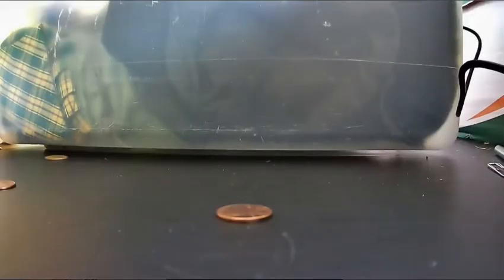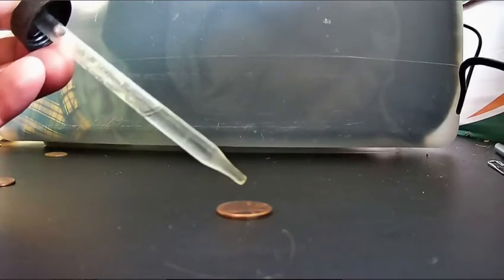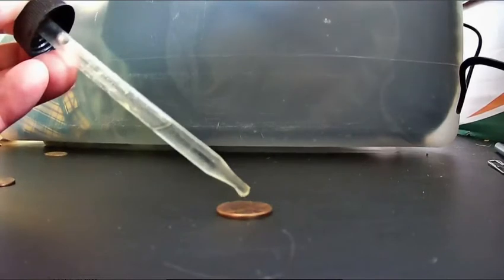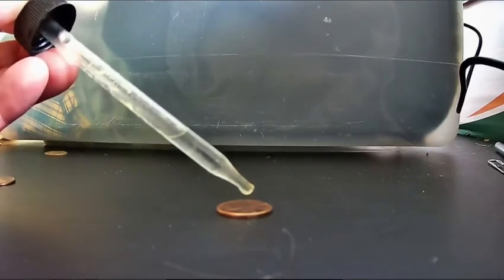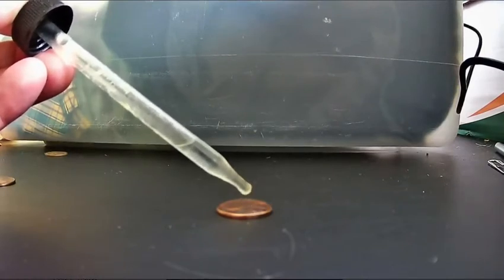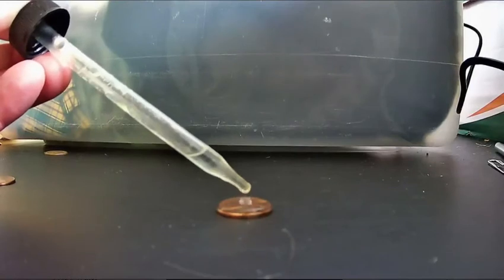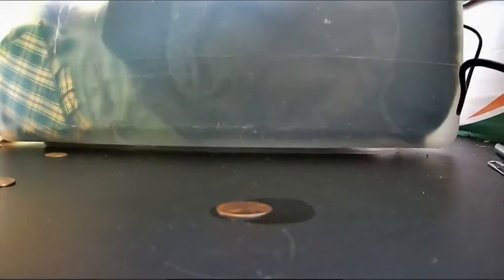Okay, here's my penny again. I have soapy water in my medicine dropper now. So we're going to count them. 1, 2, 3, 4, 5, 6, 7, 8, 9, 10, 11, 12, 13, 14, 15, 16, 17, 18, 19, 20, 21, 22. Alright, it started spilling at 22, so I'm going to mark that down as 21.